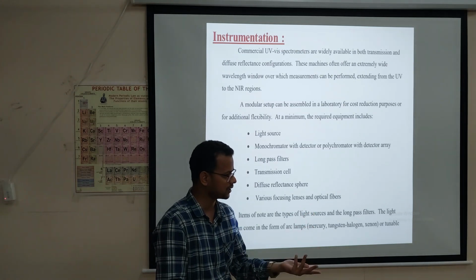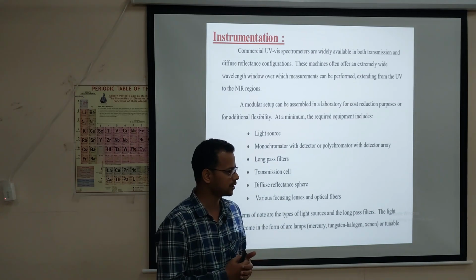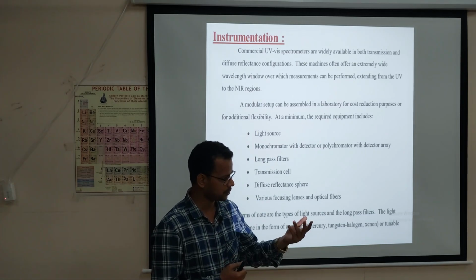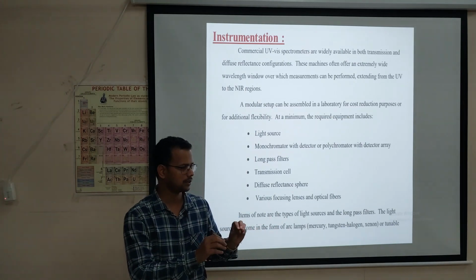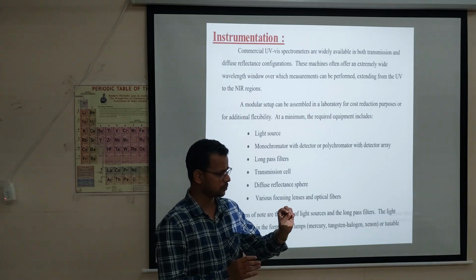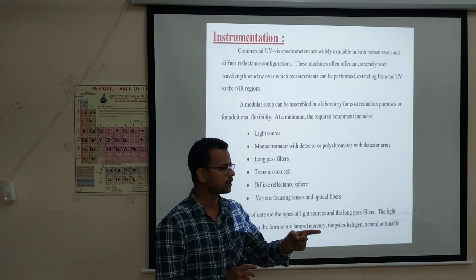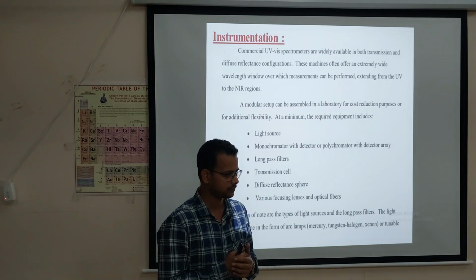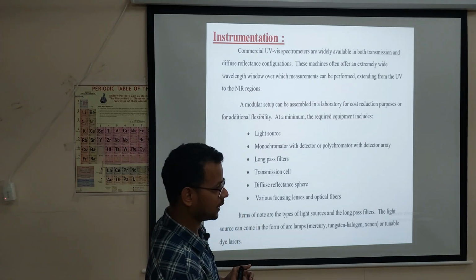Right? What is your question for semi-solid? In case of semi-solid, just tell me one example, then I will explain. As a basic fundamental, you just know that UV visible spectroscopy can be used for solid samples for qualitative measurement and for liquid samples for quantitative measurement. We will discuss that later. Clear? Okay. This is about our instrumentation.